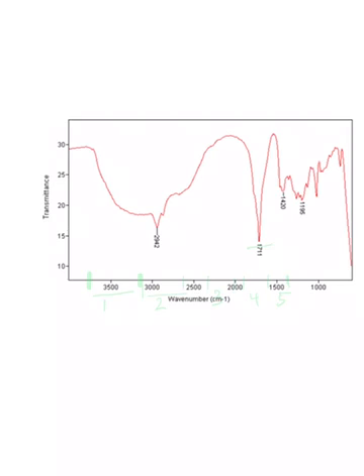In zone 1, we can have functional groups such as amines, amides, alcohols, and things of that nature. And we do have a dip here. However, it's not extremely sharp. If we had an alcohol, it would be something like this, but we don't notice that here. So we're going to just keep the alcohol in the back of our mind, but we're going to move on to the second zone to see if we can get something more evident. Here we see that we have a rather deep fang, and this is very evident of a carboxylic acid.